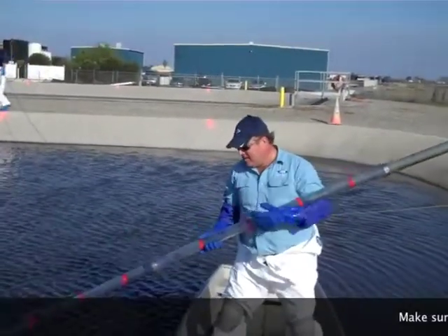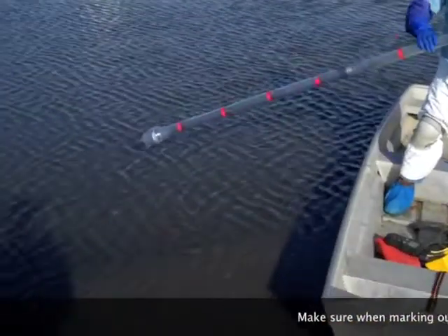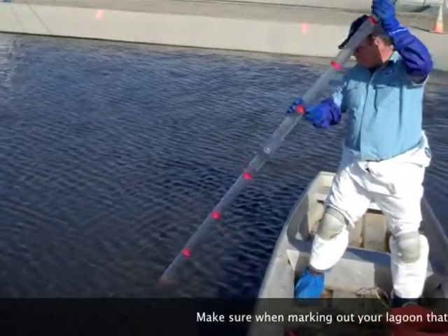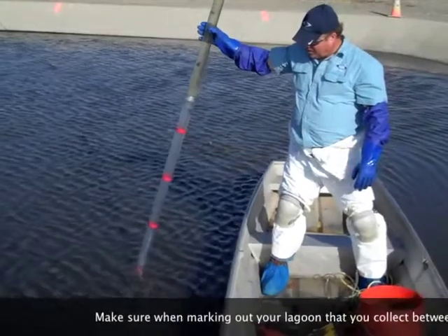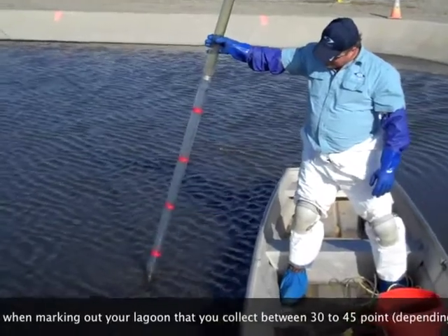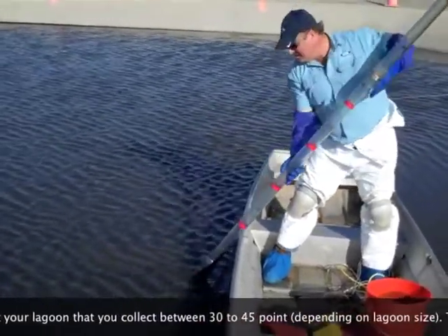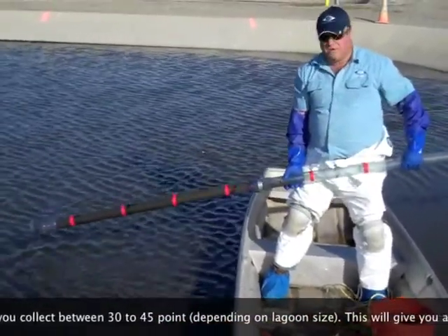Hey operators, you can see the sludge — the shelf of sludge right down here on the side of the boat. I'm going to take a course and take a sample. So I slowly lower the sludge judge in. Here we can see that the water level is about six feet, and we can see that the sludge judge is filled with sludge.